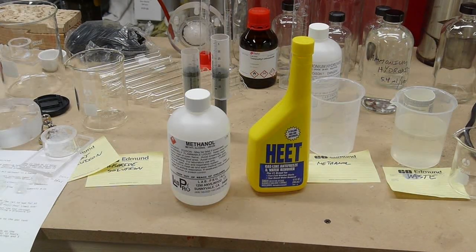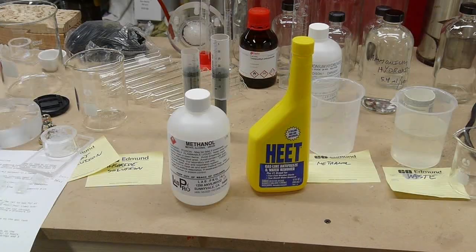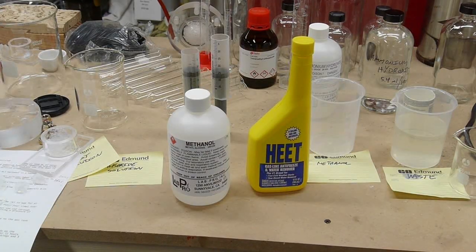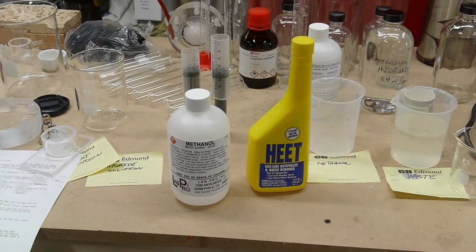And so the whole point of supercritical drying is that we can use the property of a supercritical fluid to dry the gel without disturbing its structure. So what would happen if we just left the gel out on the counter for a while to dry it out? We would end up with something called a xerogel, and as the methanol evaporates from the gel, the surface tension of the methanol will actually pull the gel's structure tighter and tighter together. So instead of a nice, lightweight, expanded aerogel, you end up with a fairly dense piece of material, because as that solvent keeps evaporating, the surface tension keeps pulling the structure tighter and tighter together. So we need to figure out a way to get the methanol out of the gel without ruining its structure. And that's where the supercritical drying comes in.